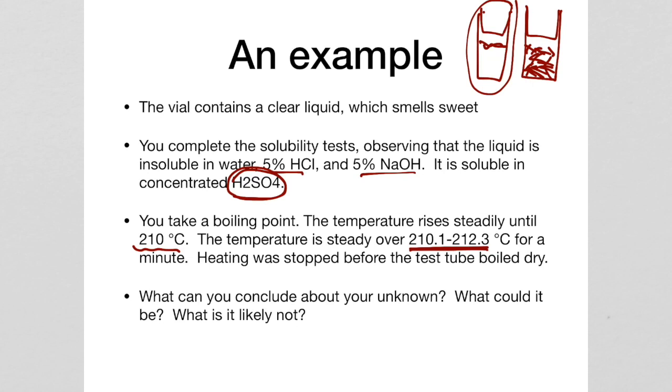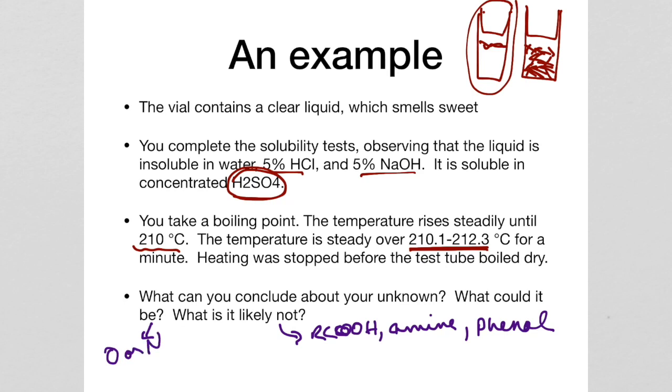So we're coming back over here. We know that we don't have a carboxylic acid, an amine, or a phenol. But we know that this is likely some oxygen or nitrogen containing functional group, or unsaturated. So, if we were doing a strict qual scheme, now we would get out a whole bunch of test tubes and we would begin testing for an alcohol, for a ketone, for an ester, for an aldehyde. That does not sound very fun. But fortunately, I'm not letting you do that.